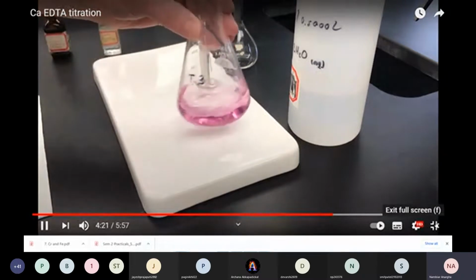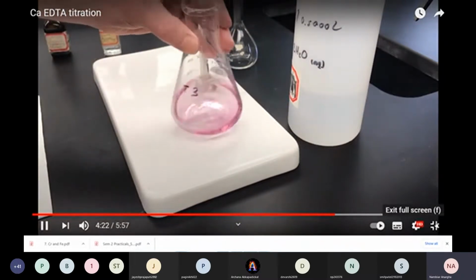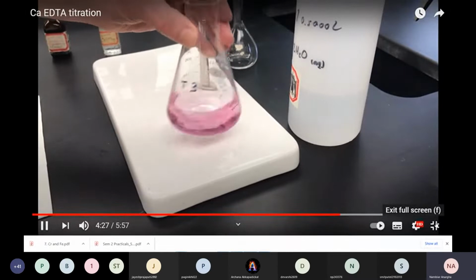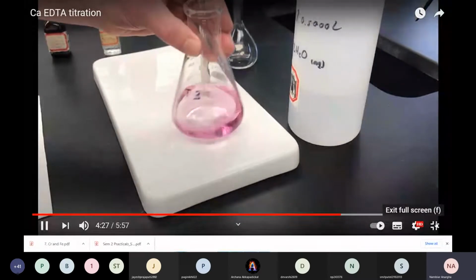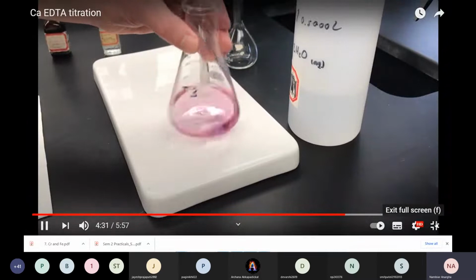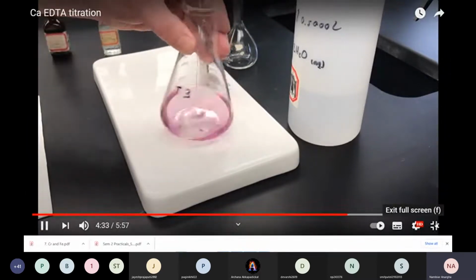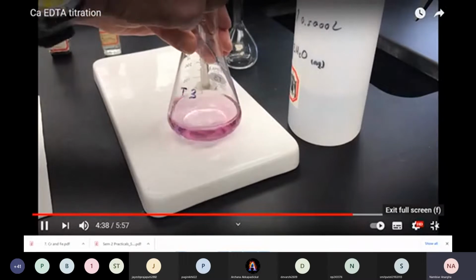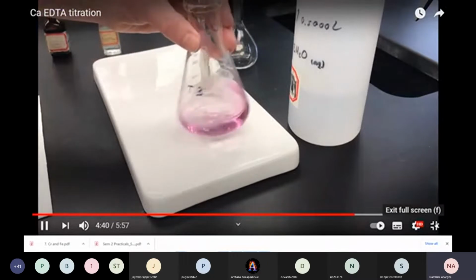And then we have to also keep in mind that the reaction tends to be kind of slow at the end point. So we want to make sure that we have time for each drop to react before we add another. So that's why I have a very, very slow drop going here. Okay, when I see that purple start to develop, I'm going to stop. Okay, it looks like I'm about there.